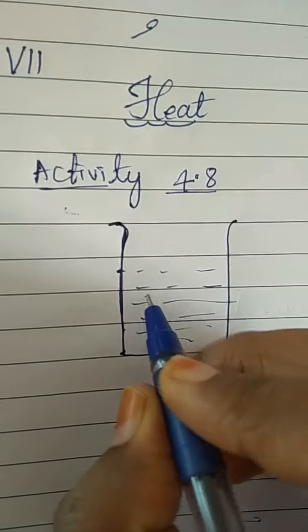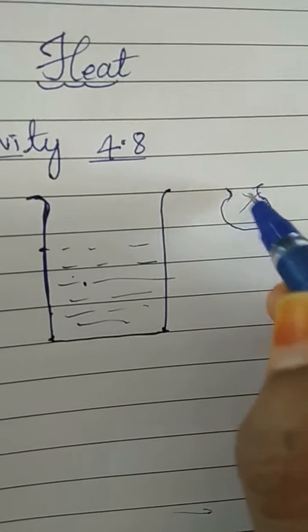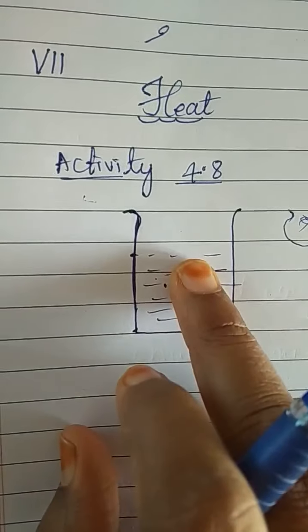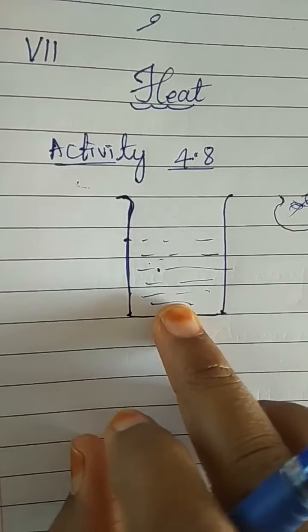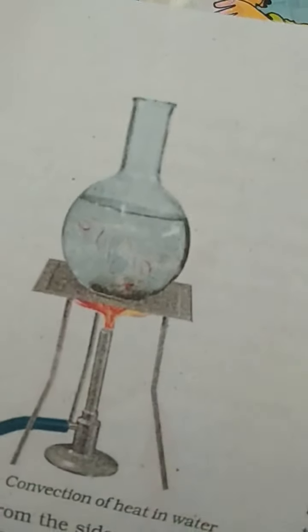Take a round bottom flask, which will be like this. If it is not available, take a beaker. Fill it two-thirds with water and place it on a tripod like this, to heat the water. We have to arrange it like this.